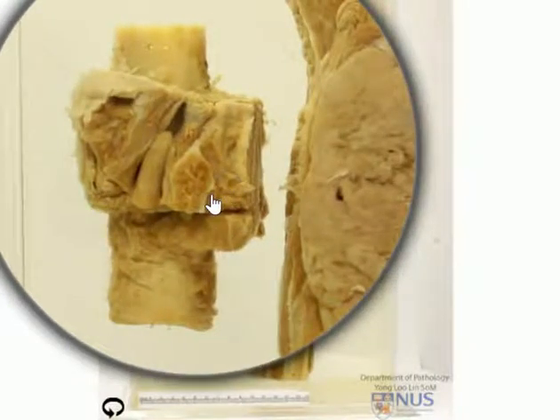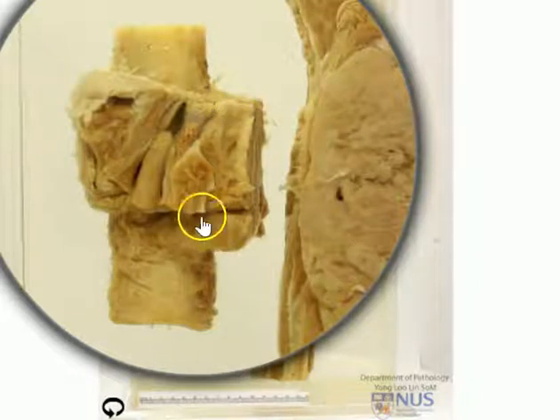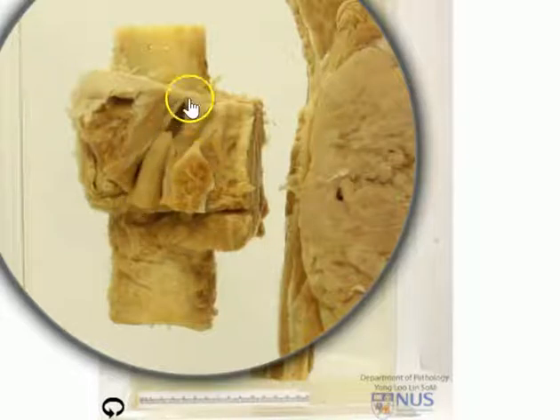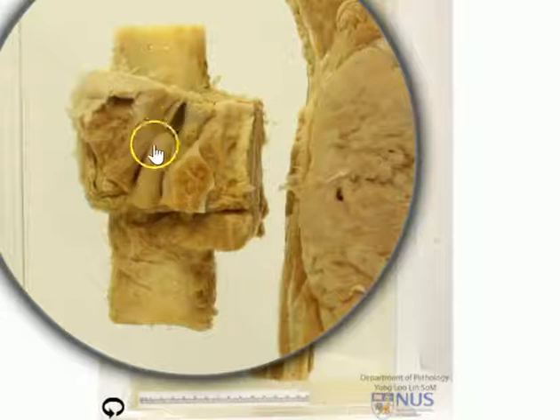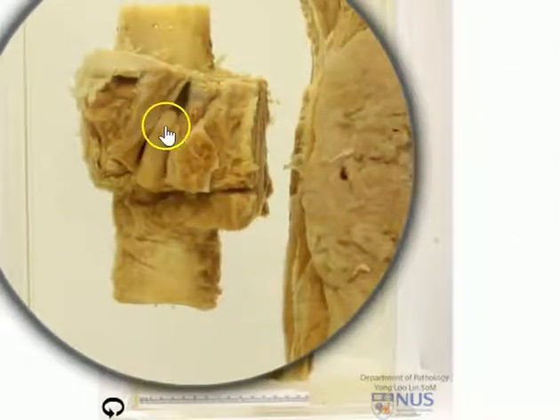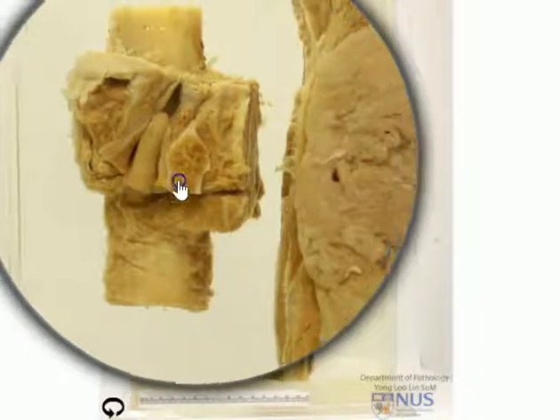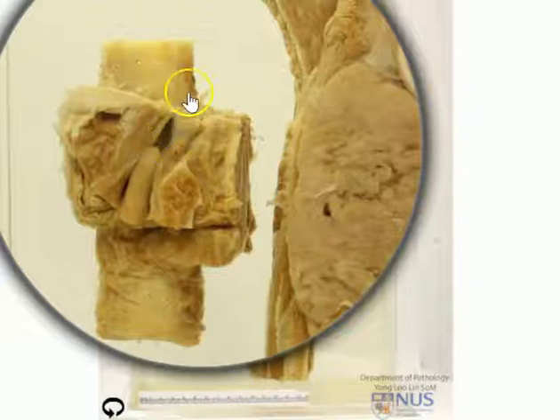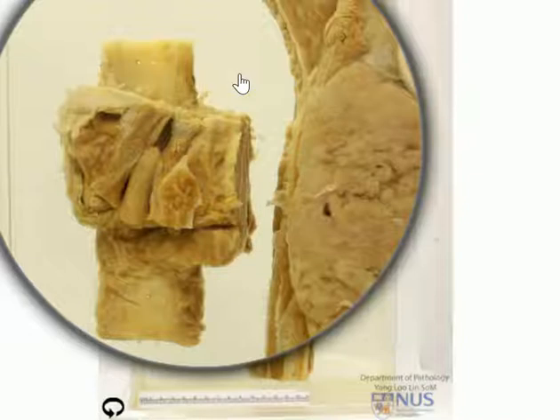What we see over here would be attached to the fibula. This is some soft tissue with skeletal muscle, and this is actually a vessel that has been opened longitudinally. Within the vessel, there is a solid tissue piece here — this is indicative of a tumour thrombus. So this malignant tumour from the tibia has actually spread into the vessel here, which is probably a fairly large calibre vein, and from this vessel it can potentially follow the venous return and go to the lungs, causing distant metastases.